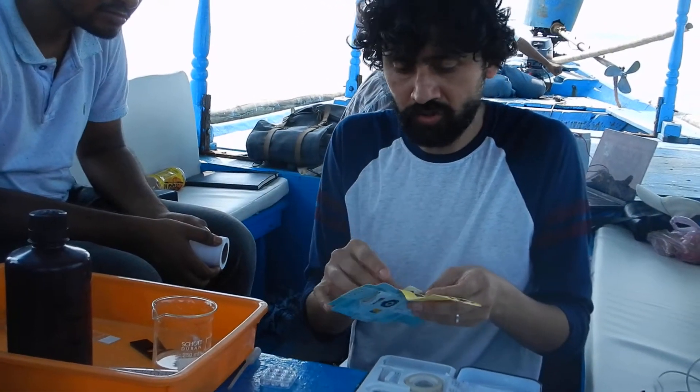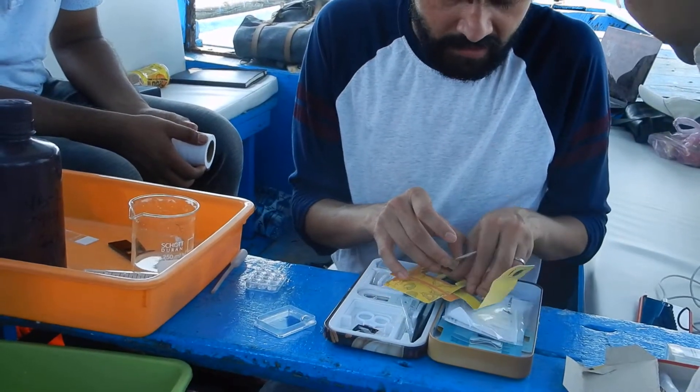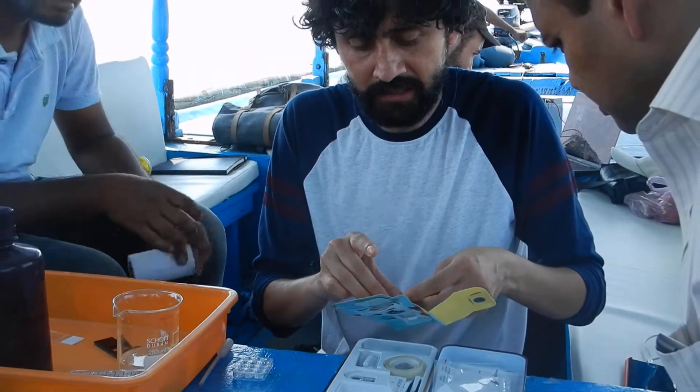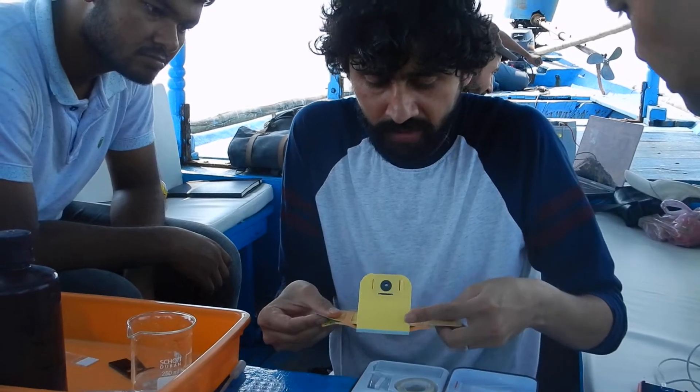So this time, one of you should operate and run this. Maybe I'll do this as the last one, and then you should mount it on your own Foldscope and get the same quality image as I am getting — just as practice, because it's very important to practice.